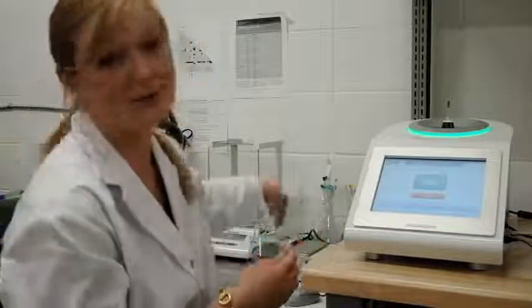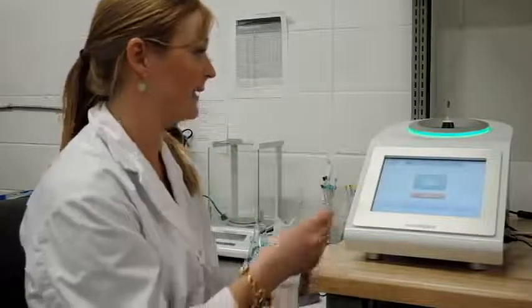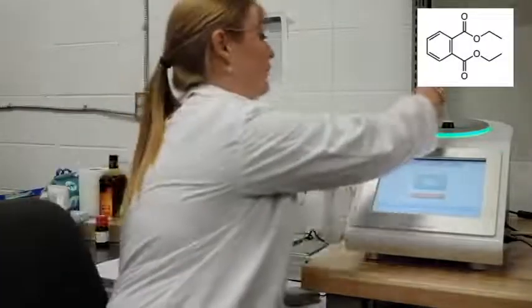I pre-prepared my samples in standard 5mm NMR tubes using deuterated solvent. Deuterated solvents are recommended, as is pretty typical with NMR, but they're not absolutely required for the use of good data. The first sample I'm going to run is a 0.5 molar solution of diethyl phthalate in deuterated chloroform.